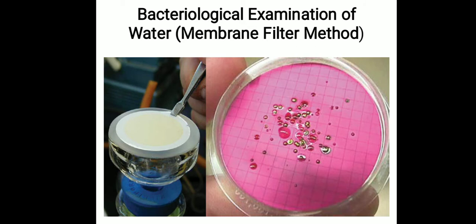Bacteria-type membrane filters capable of retaining microorganisms larger than 0.45 micrometer are frequently used for analysis of water.